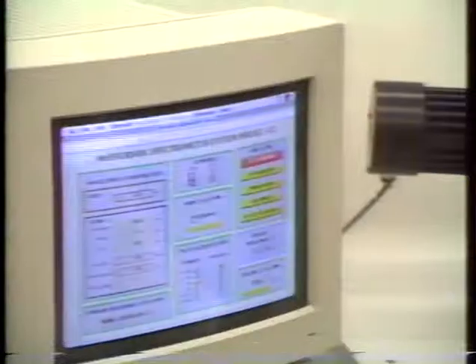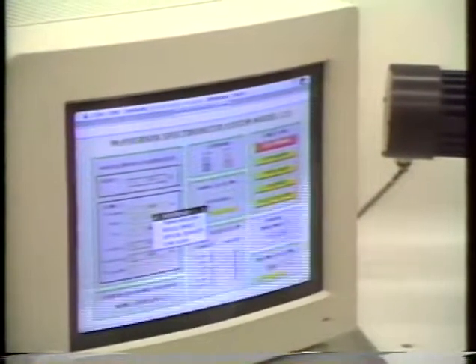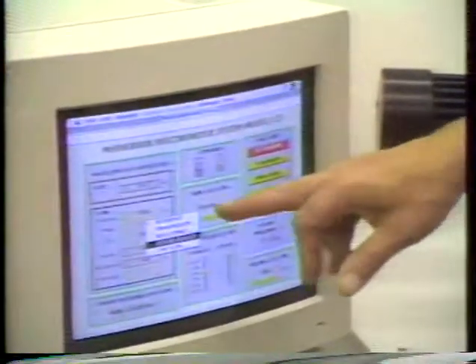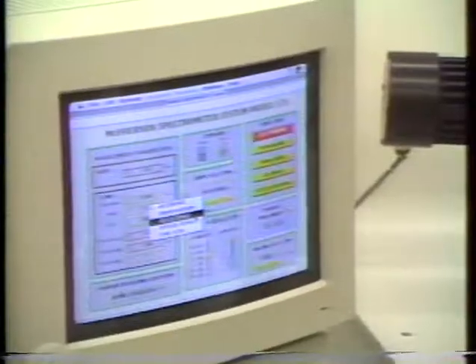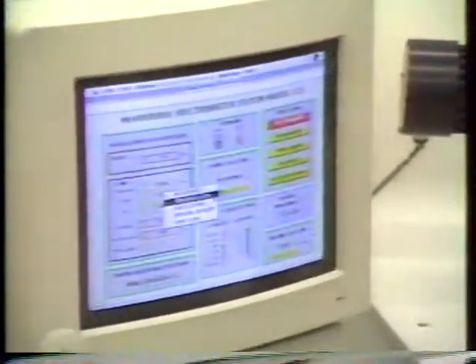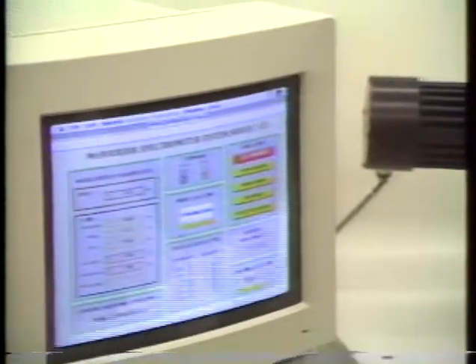Now at this point you could go on, you have your samples ready, and do reflectance or transmission right here. These are the functions I mentioned before. We can now run the reference, the transmission, the reflectance, optical density, or a time scan, which would give us the dynamics of an event. That means if we had a gas which is photochemically affected, we would probably see its reaction. Very good.